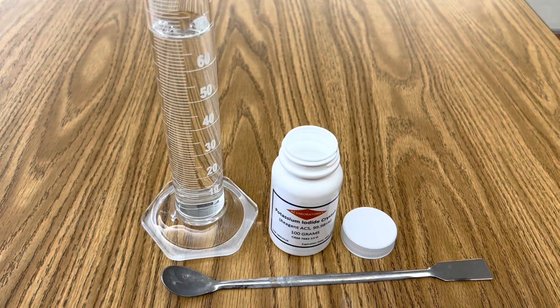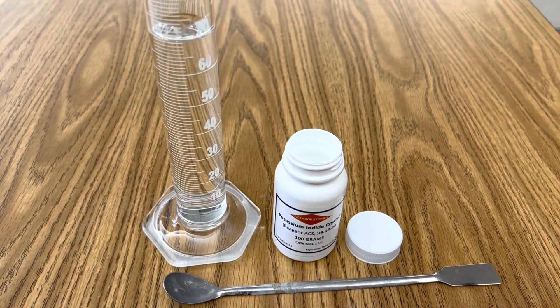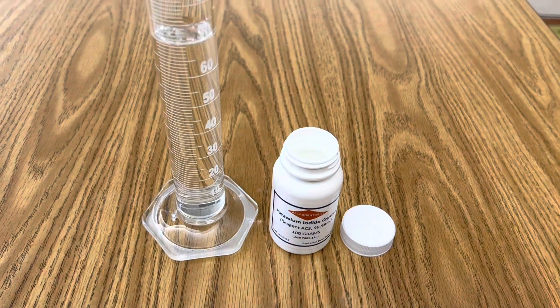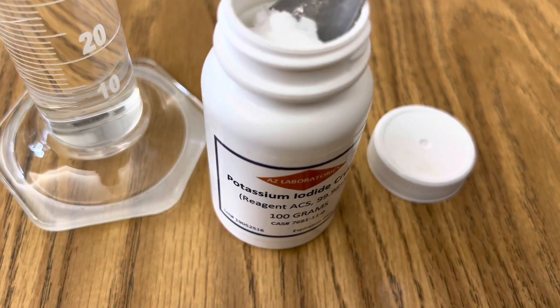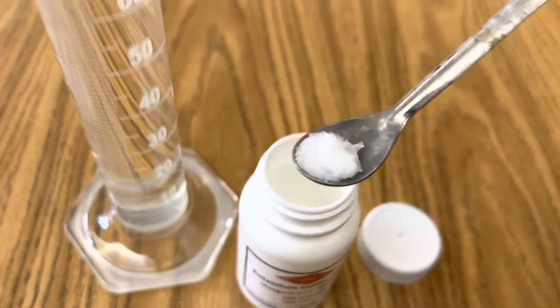The next step is to fill your graduated cylinder with 70 milliliters of distilled water and add four grams of potassium iodide and stir your solution until it's completely aqueous.